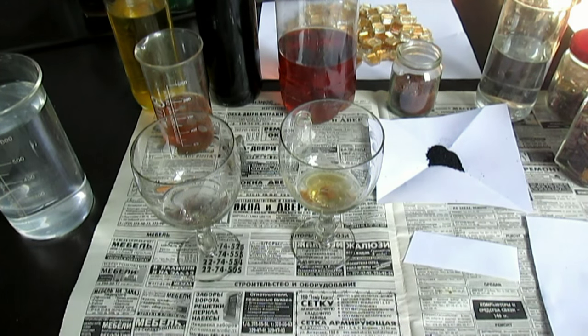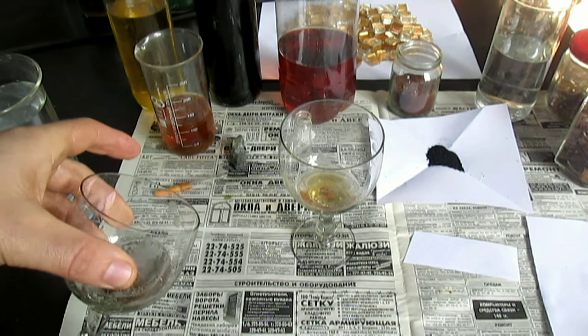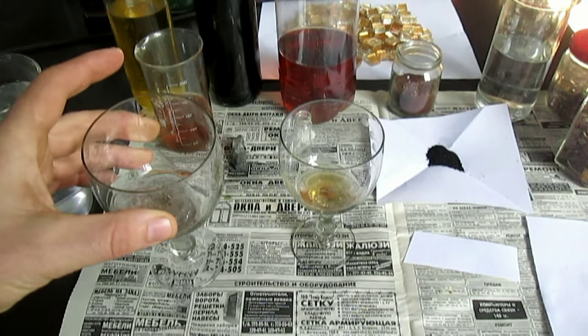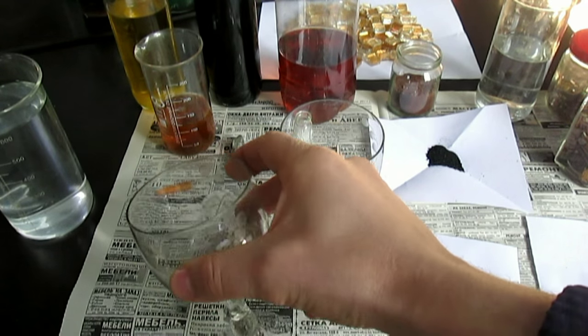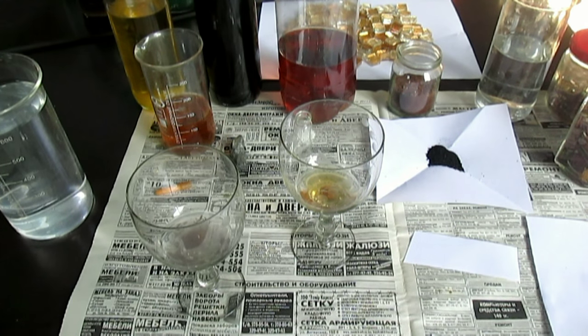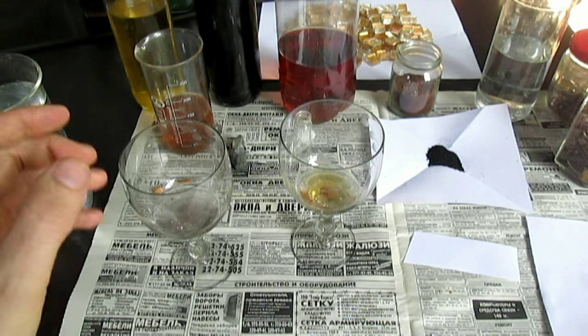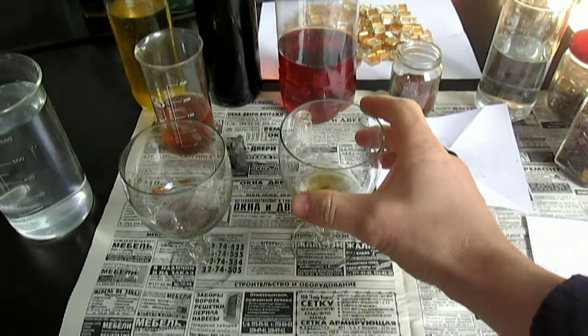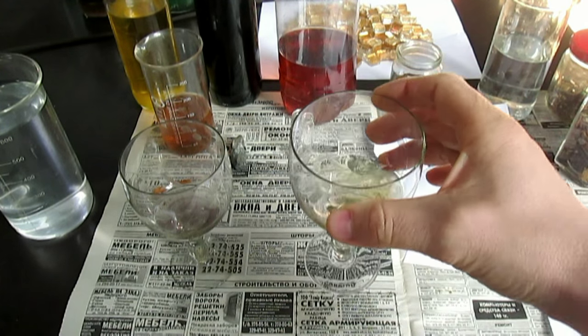Ещё что я заметил: золото, которое растворяется в суперреагенте, по-моему, не имеет никакого цвета — то есть прозрачный раствор получается. С кислотой как? Кислоту греть надо, чтобы она лучше растворяла золото. Холодная почти не растворяет. А суперреагент, кстати, растворяет золото хорошо при обычной температуре. Его, наоборот, греть не надо, так как он разлагается.